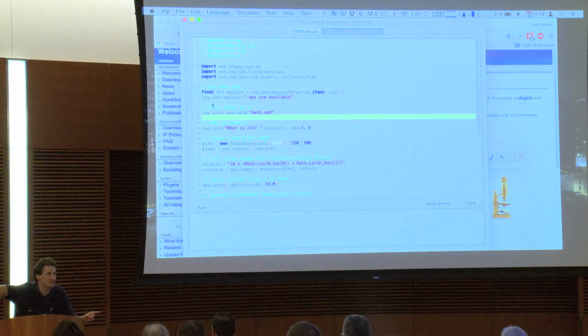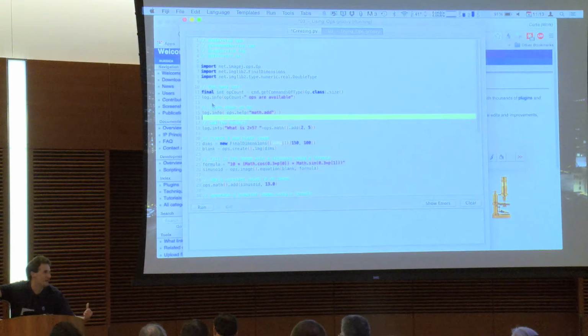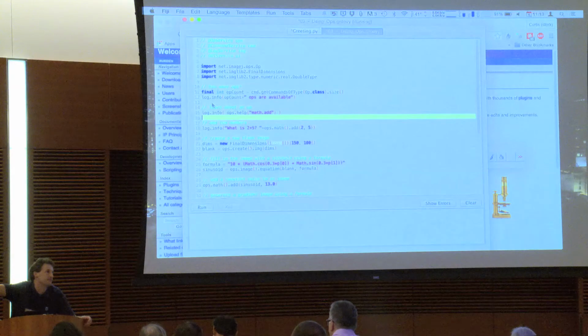So far for random number generators, all of our random stuff uses seed as input. So that it kind of punts, right? Somehow someone still has to choose a seed, but the op itself will always give back the same number. So this makes unit testing easier too, but it doesn't actually help you in your script, where you then have to somehow do it.